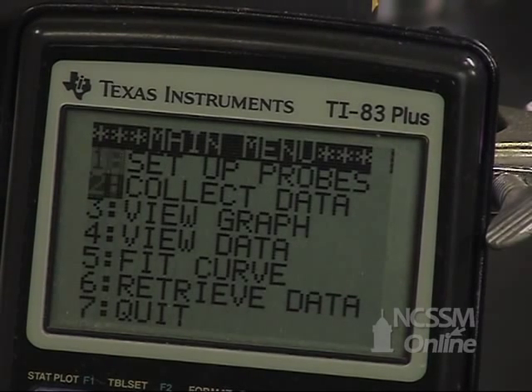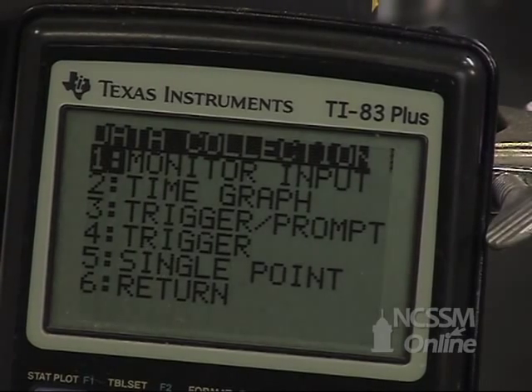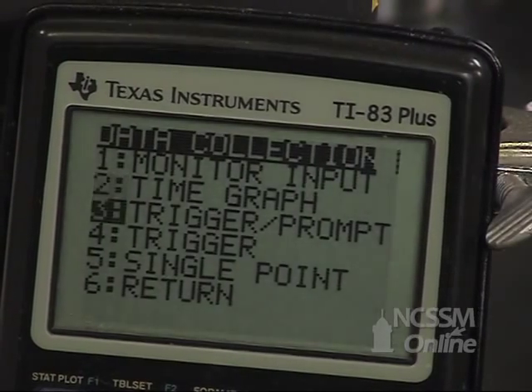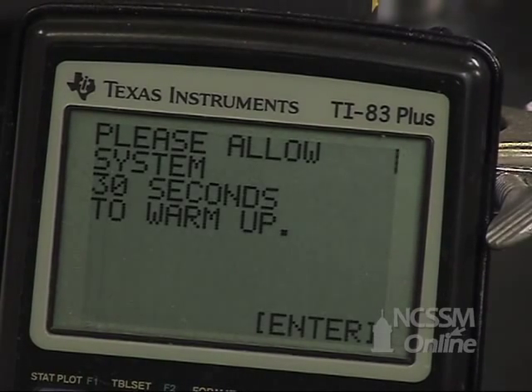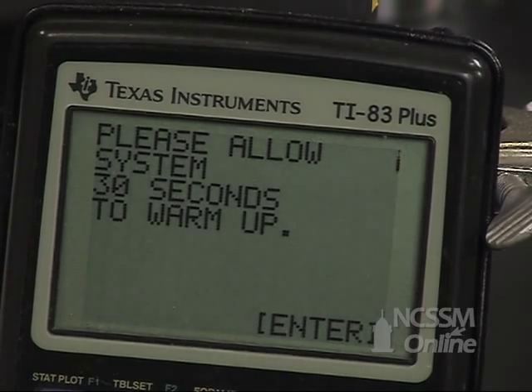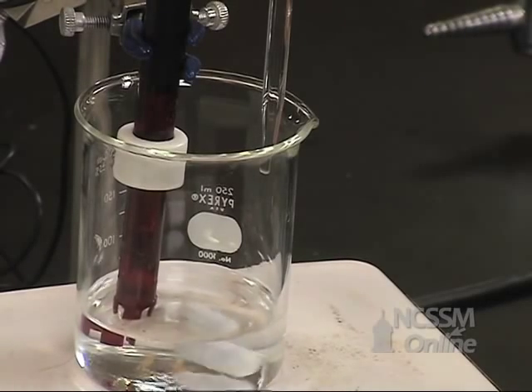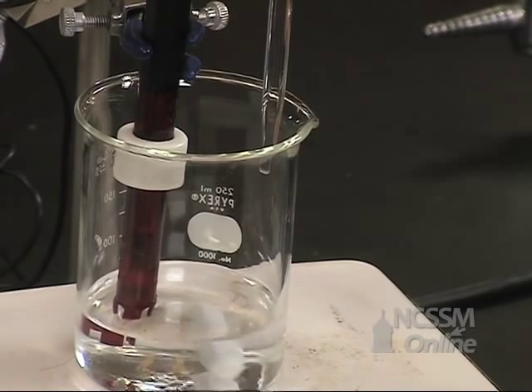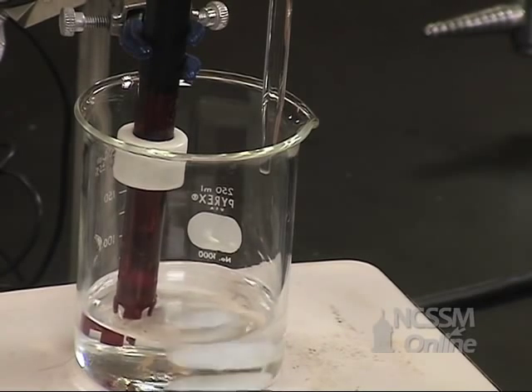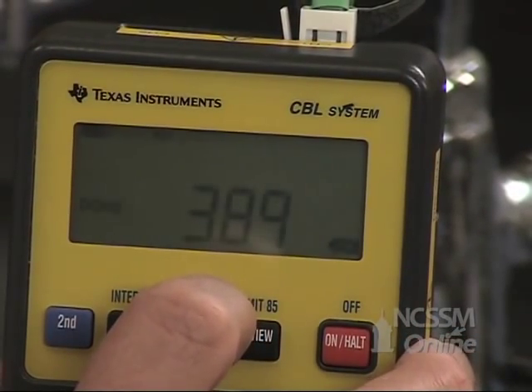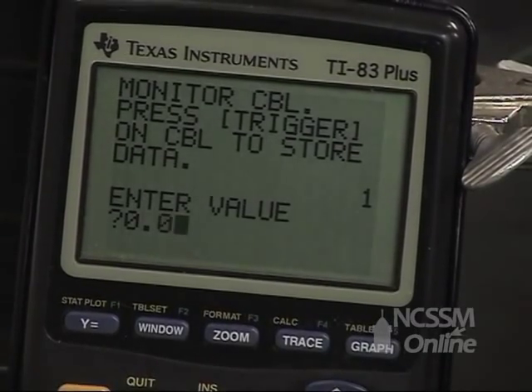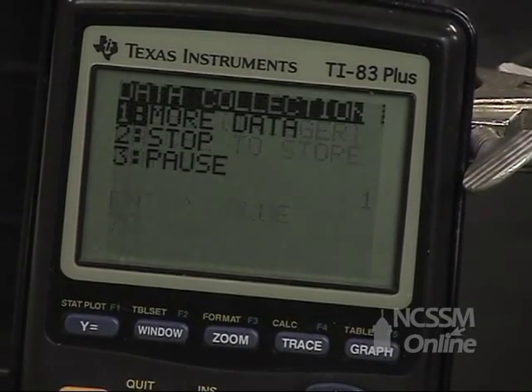We're going to come down to collect data and select trigger prompt. We're going to wait 30 seconds for the electronics to warm up. We're going to take an initial reading with 0 milliliters of sodium hydroxide added. This will give us the initial pH of the phosphoric acid solution. When the CBL is stable, we're going to press trigger and enter the volume on our calculator: 0.00 milliliters.